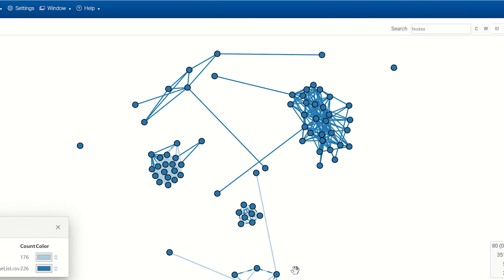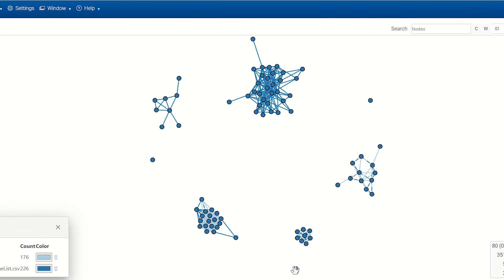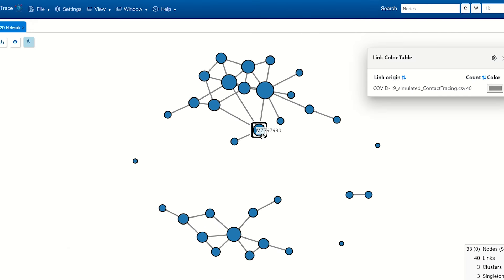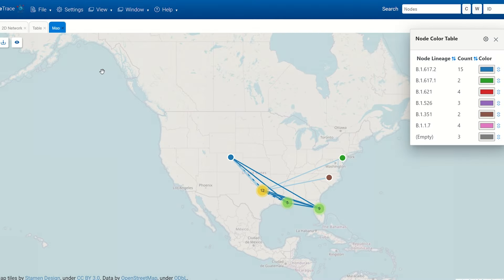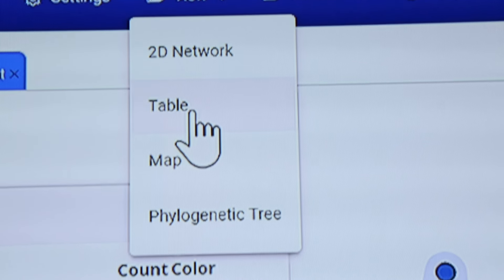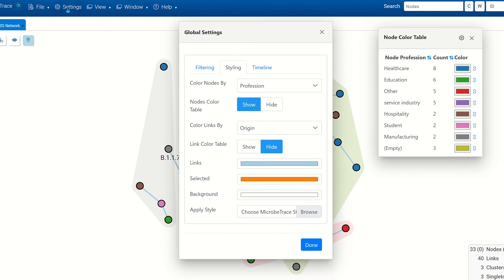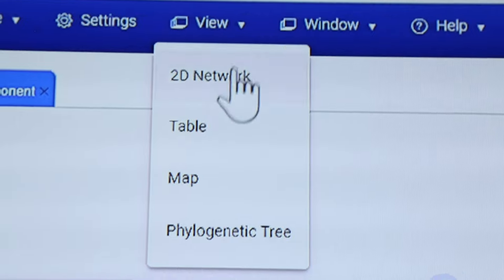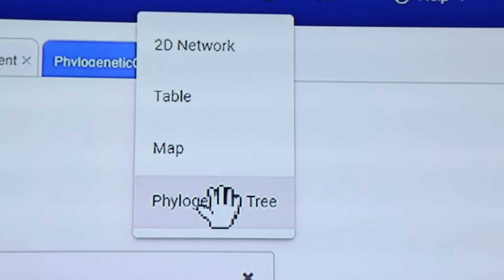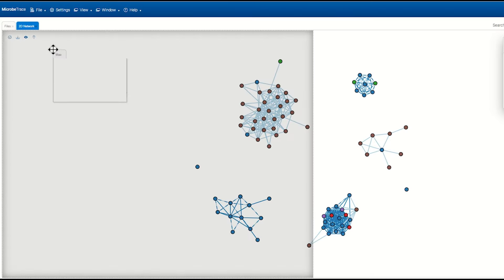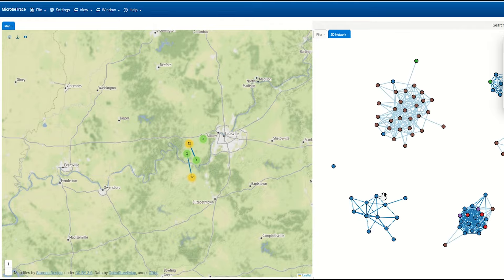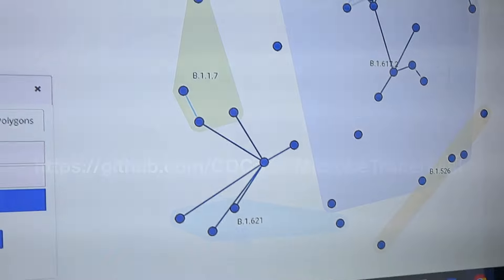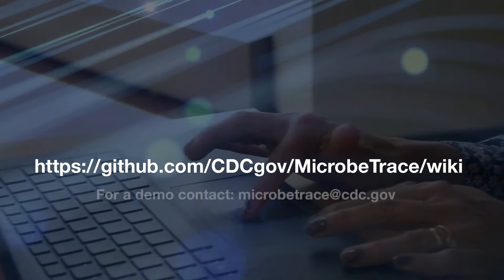Use MicrobeTrace to produce multiple interactive spatial and temporal views such as 2D networks, mapped view, tables, timeline, and phylogeny, or drag and drop to create a dashboard view. Get started with MicrobeTrace for brilliant visualizations today.